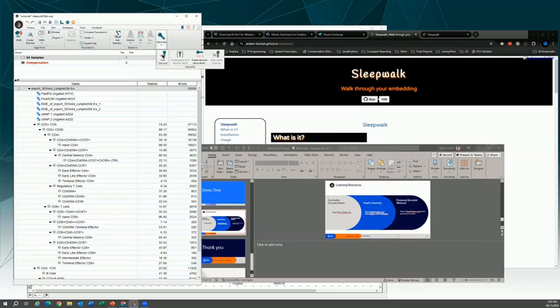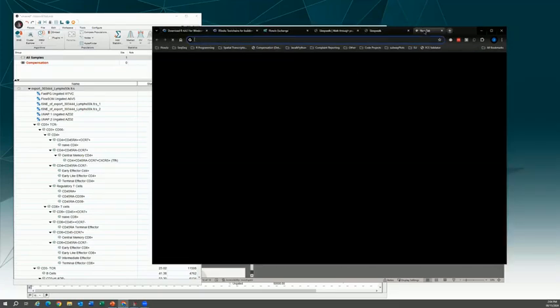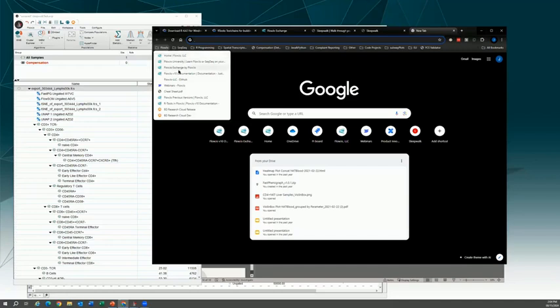And then you might go through the traditional high parameter workflow where you do dimensionality reduction and clustering, and then you'll take that into Cluster Explorer. With Cluster Explorer, you can leverage those keywords as long as you've gated those apart in the concatenated file. You can load those keywords essentially into Cluster Explorer and then make some comparisons really easily that way.